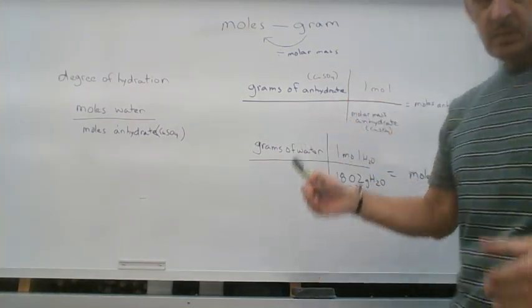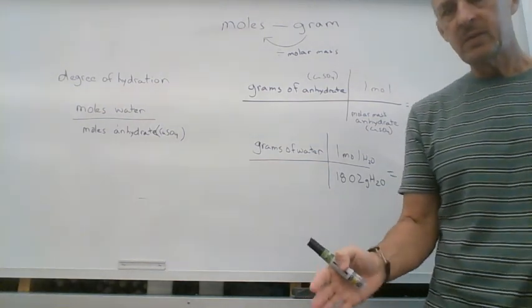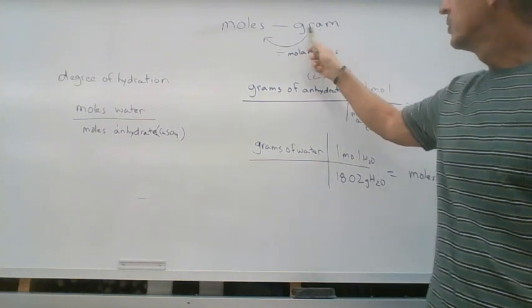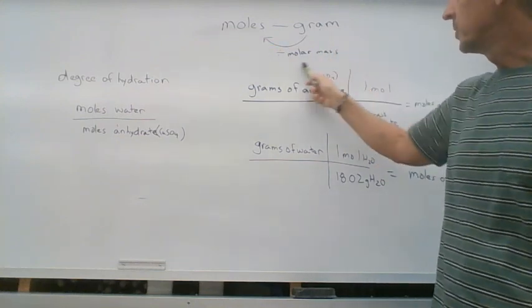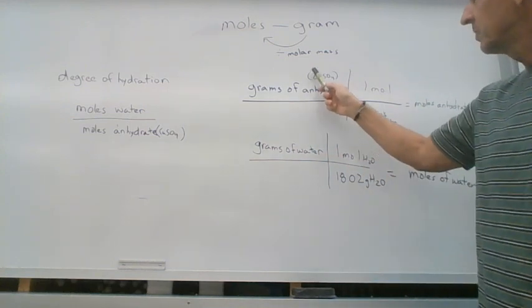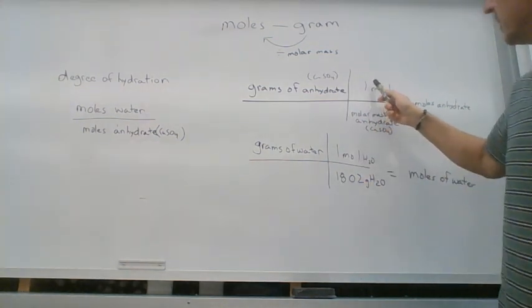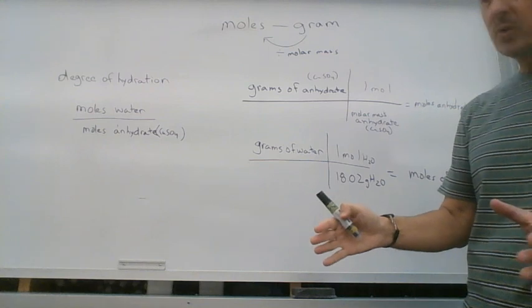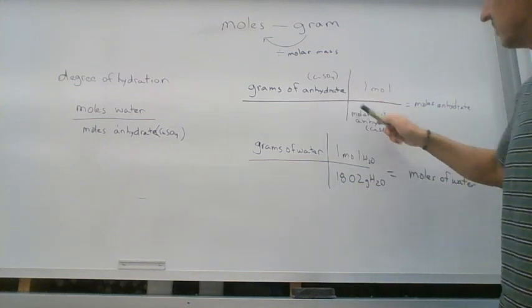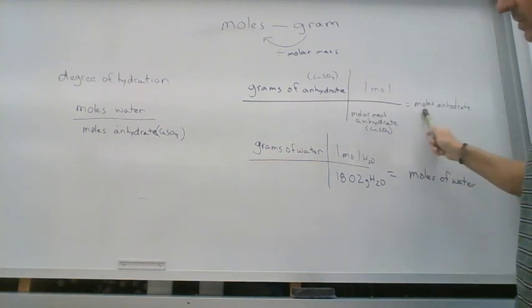All right, so in the lab, all we can do is measure grams, right? But in this situation, we want to know moles, and so we need to know the relationship between grams and moles. So remember, from our mole map, to go from grams to moles, we divide by the molar mass. So from the previous data you collected, you know the grams of anhydrate, which means the grams of copper sulfate. That's after we've driven off the water. And then you're going to take that molar mass of anhydrate that you calculated at the top of the page, divide grams of anhydrate by molar mass of anhydrate, and that will give you moles of copper sulfate.